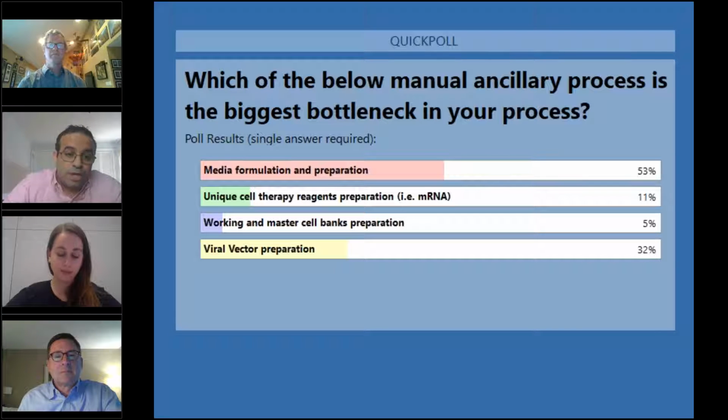So in terms of trade-offs, you can design a system that fills vector into bags at 5 mLs fairly accurately, but if your process improves and your transduction efficiency is a bit better, and you can drop that volume down to 1 ml, the accuracy may not be as good.